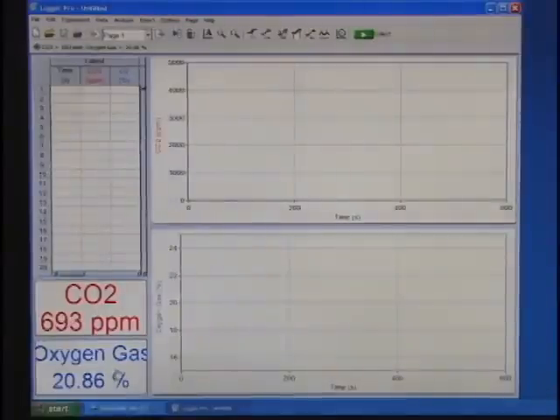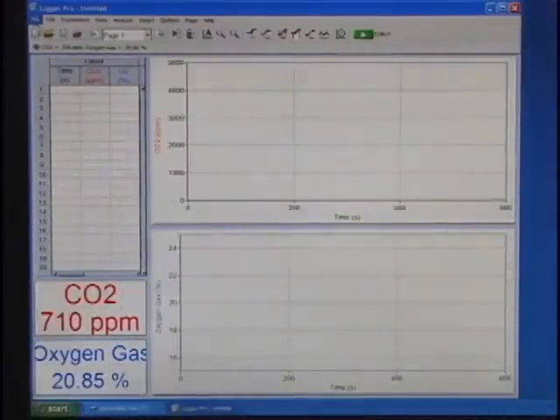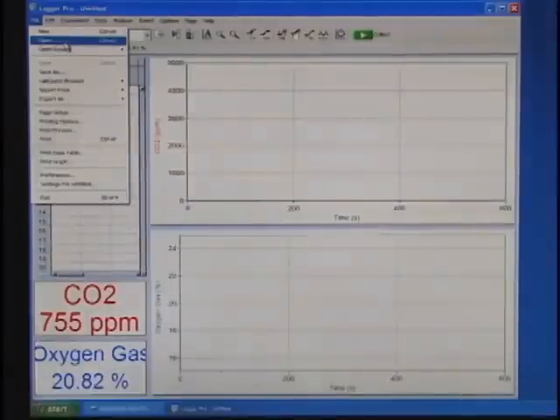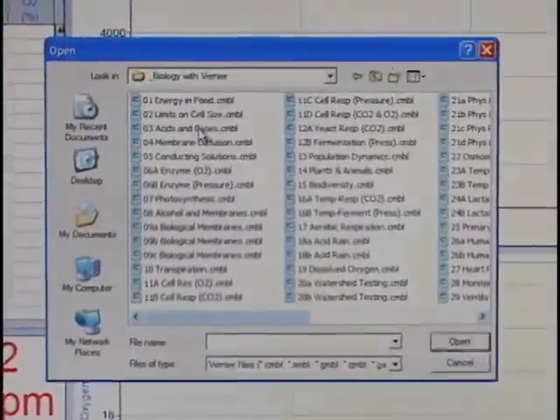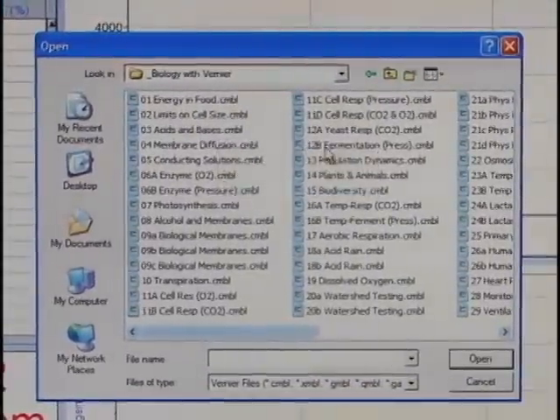For this particular experiment, we need to open an experiment file. To do this, go to File, Open, click Biology with Vernier, and choose Experiment 11D.